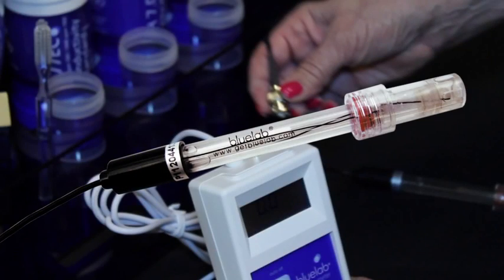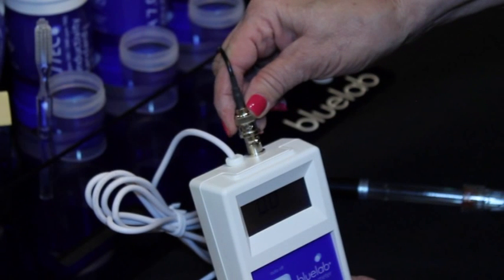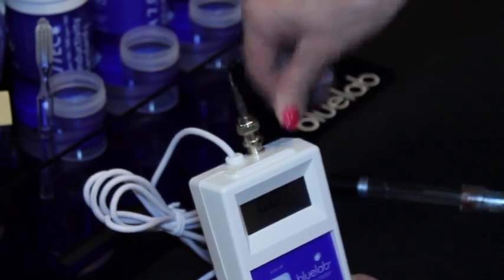Remove the replaceable pH probe from the box. Connect the pH probe to the combo meter by lining up the lugs of the BNC fittings, then fasten securely by pushing the pH probe connector on and twisting one quarter turn.